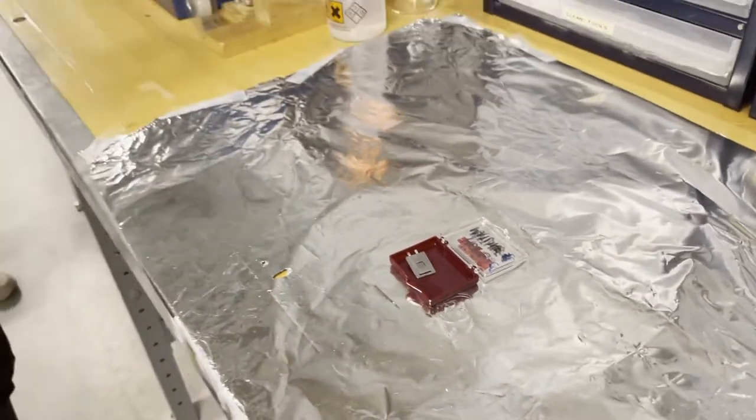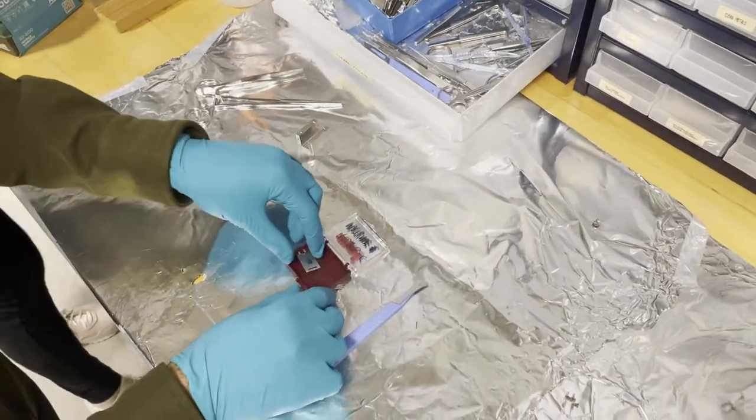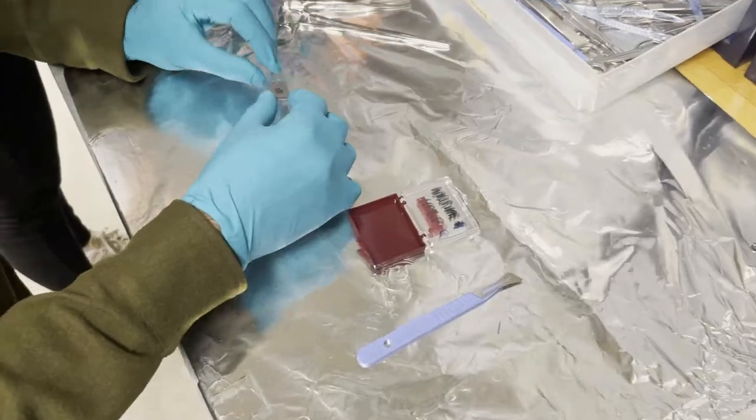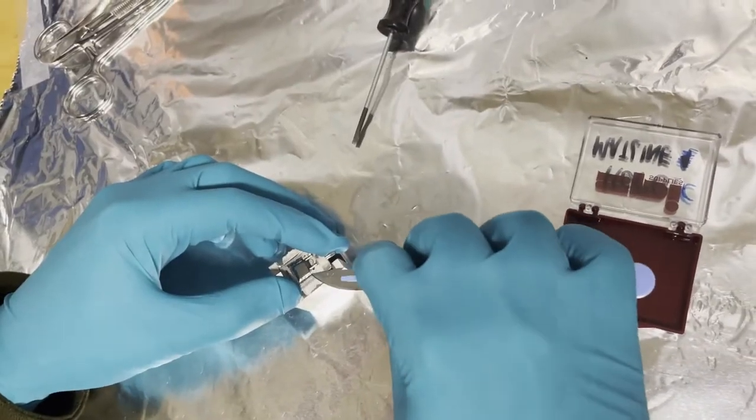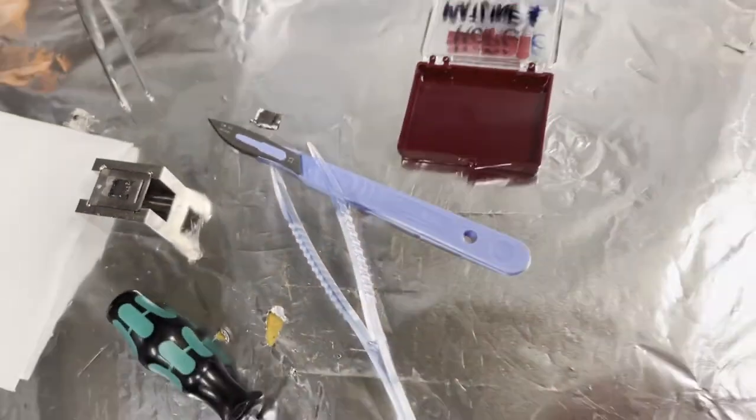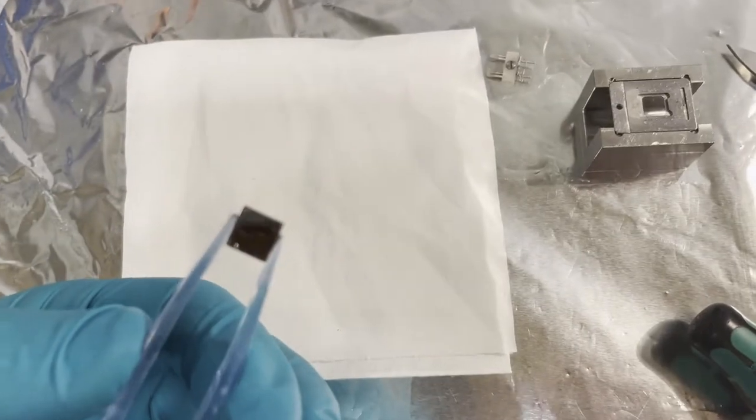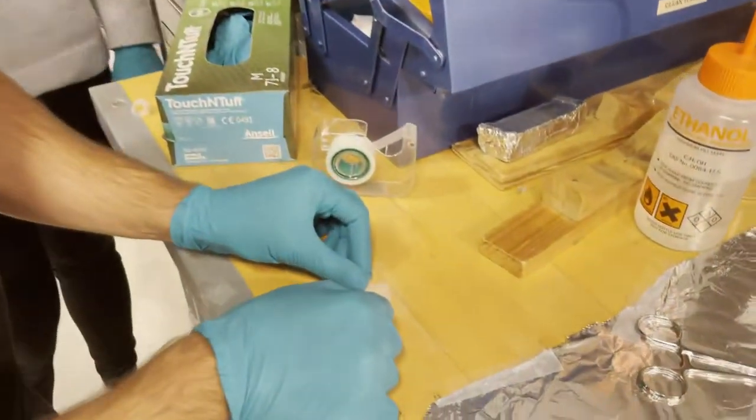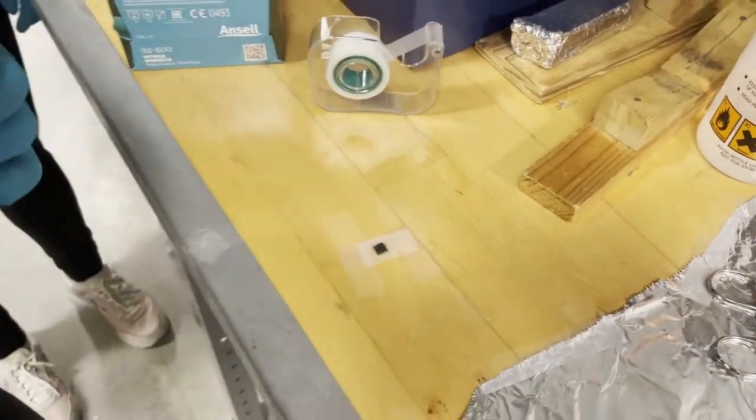We first need to prepare our graphite sample. In order to measure, we need our sample placed in a sample holder like the one you see here. In order for us to scan effectively, we need to have a flat surface, so we need to remove the top layers by cleaving. For that purpose, we use regular scotch tape.